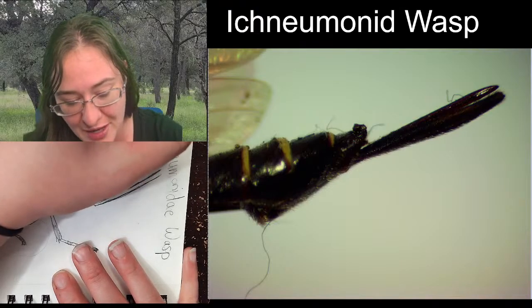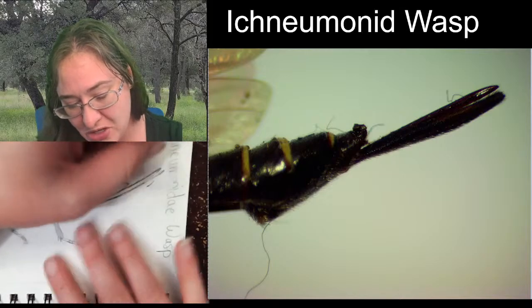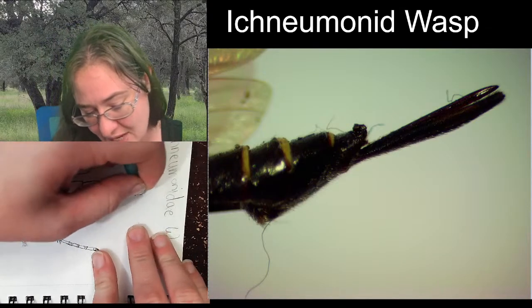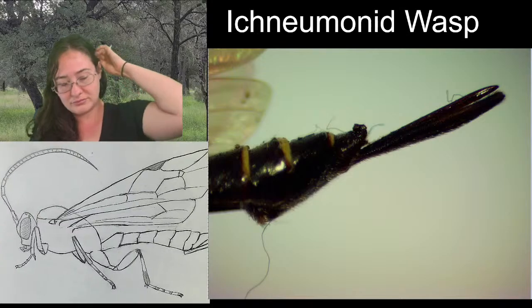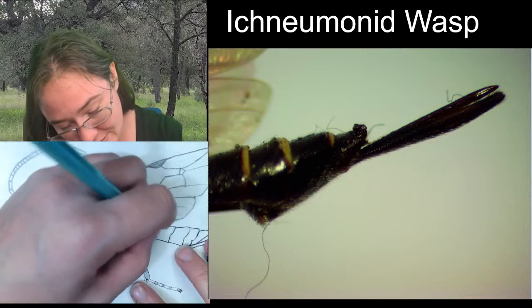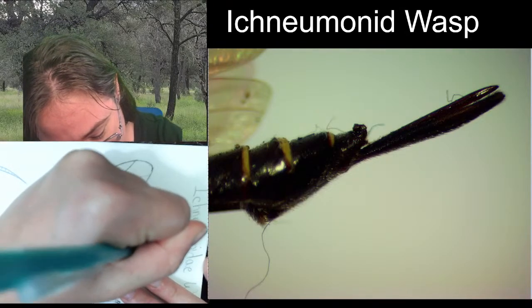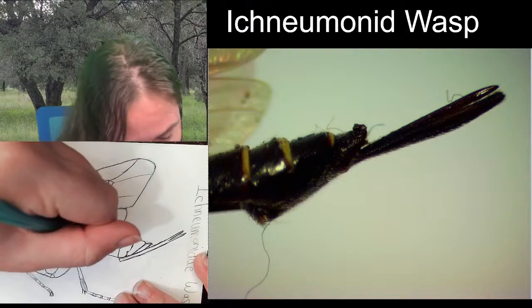just like the mouth part of a true bug, where they have those piercing and sucking mouth parts, and when they pierce, the tube in the center is for drinking, and then it has the two pieces on the outside that are the sheath that help protect it and help pierce. That's the same thing with our ichneumon here. And that, my friends, is our ichneumon wasp for today. It's so pretty. This one I'm definitely going to be putting in the book. I'm pretty happy with this one.